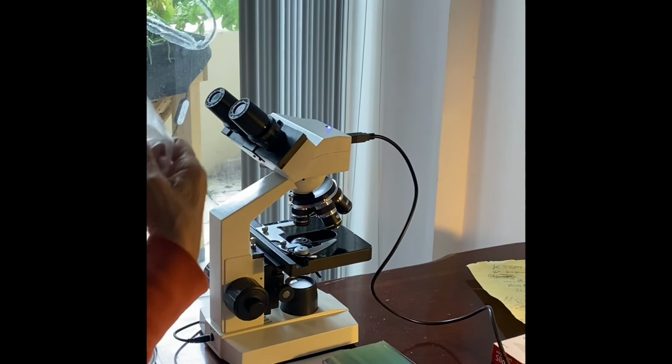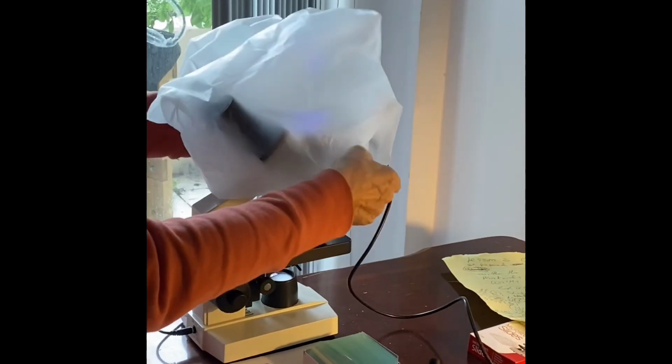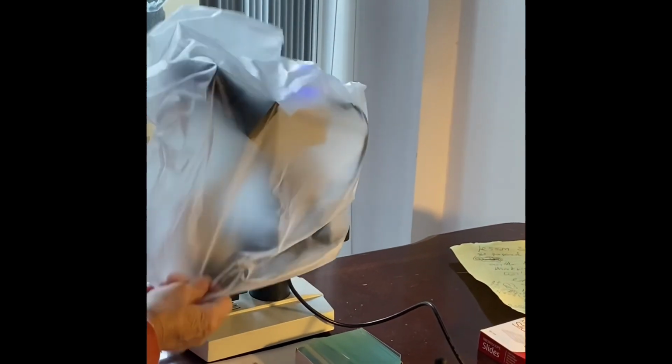Put the cover over the microscope. Unplug the cord, or the cord may be attached to the microscope.